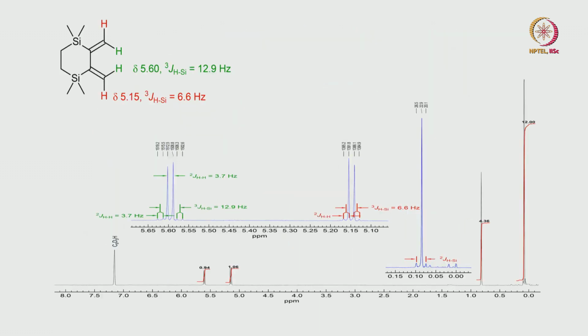We are going through this. You can have a large number of such examples, but I want to show you one example like this, where a molecule like this, if the symmetry is not broken, both are identical, these protons are identical, these are identical. Whereas when I take the NMR spectrum of it, you see this one proton easily. But I have expanded two peaks here. These two peaks correspond to these protons.